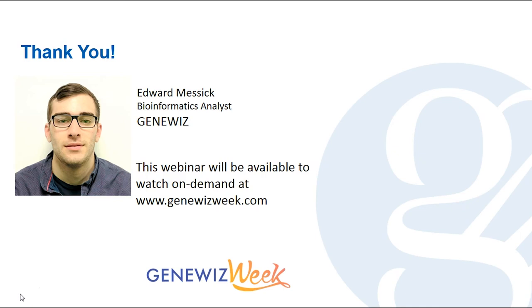So the first question I have on the screen has two parts. The first part is, can whole genome shotgun metagenomics be applied to mixed populations of bacteria, fungi, viruses? And the second part of that question is, is there any type of organism that cannot be detected by this technique?